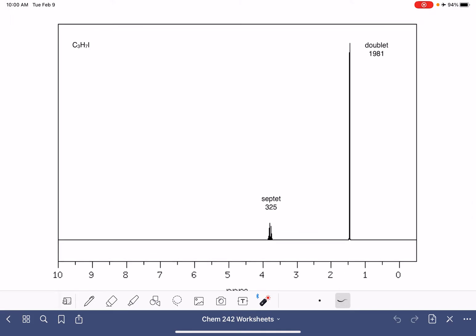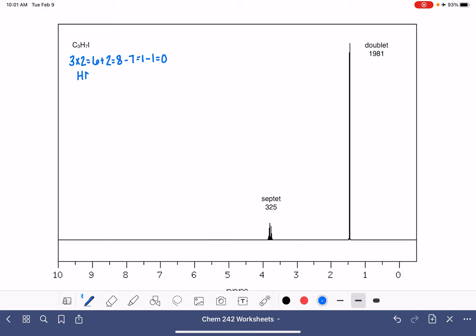Here's the first structure. We're going to begin by doing the HDI calculation. This is done by taking 2 times the number of carbon atoms, which is 6, plus 2, which gives us 8, subtract the number of hydrogens, and subtract the halogen iodine to zero. So this is an HDI of zero. That means we don't have to worry about double bonds, triple bonds, rings, anything like that. The next thing we're going to do is focus on our integration.